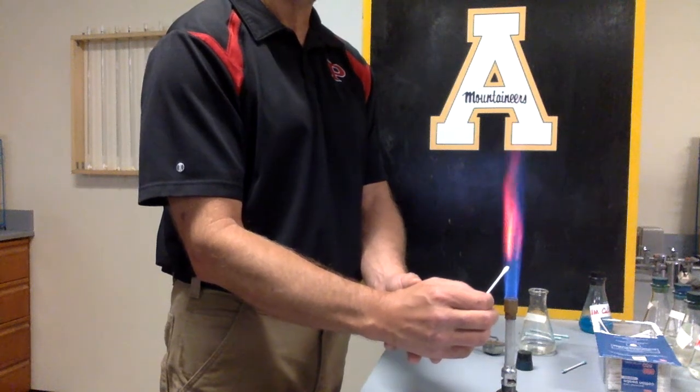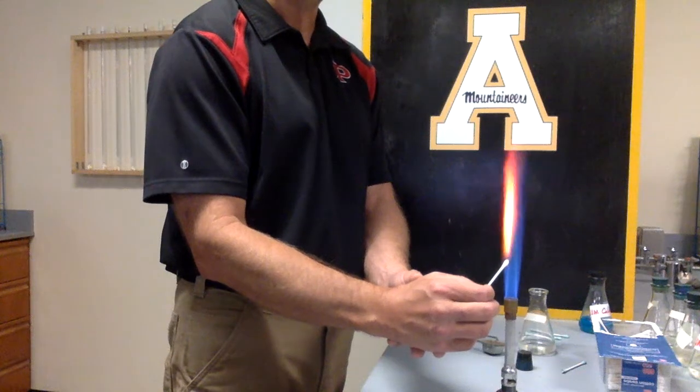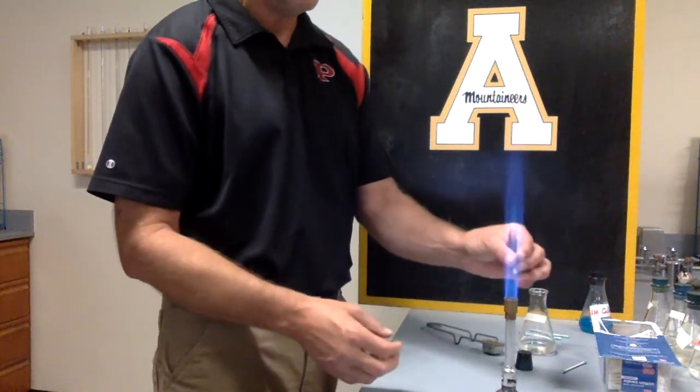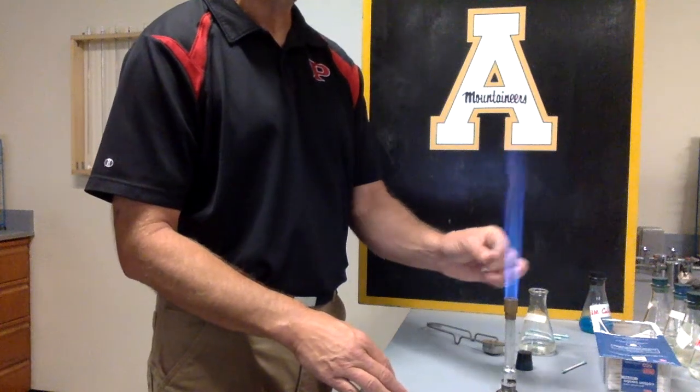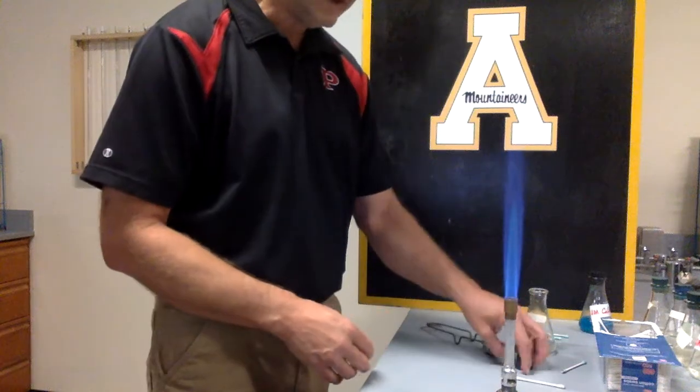Are you getting that one? Oh yeah, that's a good color change. You can definitely see that one, and that's going to be a nice pinkish. Do it on this side. Maybe you can see it. Yeah, it's a nice pinkish color.